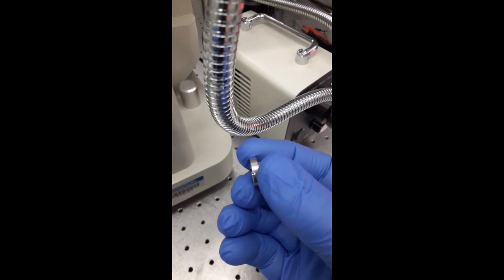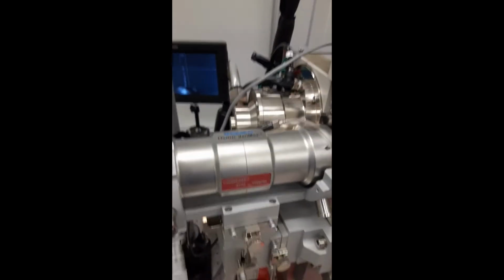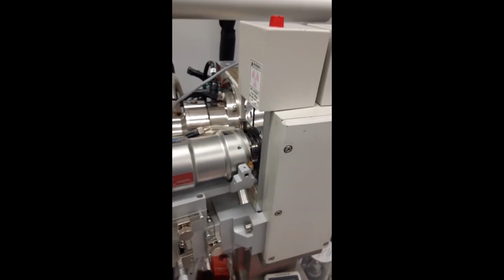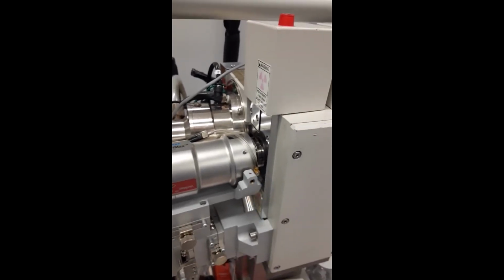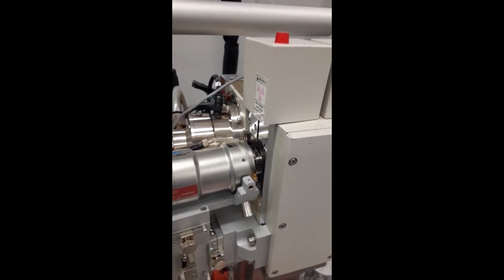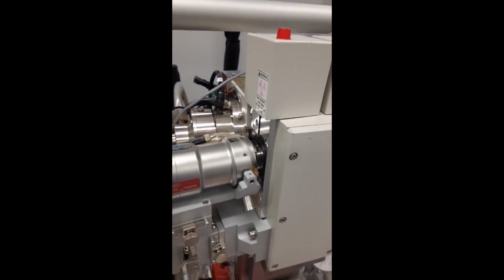Once the X-rays leave the beryllium window, they can enter the mirrors and travel down the collimator to the sample. There's one more step that keeps the X-rays in there before we want to use them, which is a shutter made of copper, which acts very similar to a shutter on a DSLR camera, and is computer controlled whether it opens or not.